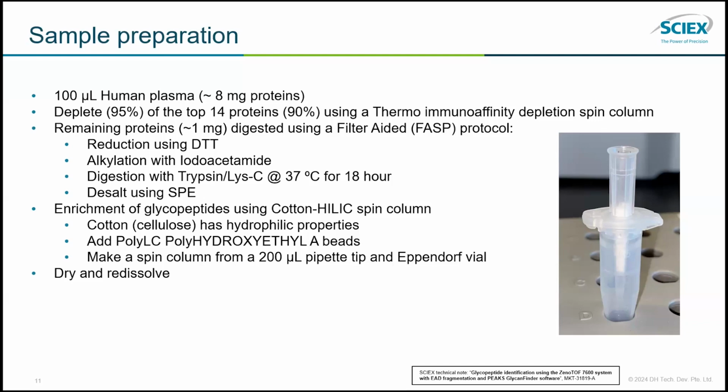It acts kind of like a HILIC phase, a very cheap HILIC phase, of course, and it also holds the HILIC beads together in the pipette tip, right? So that provided, as you will see later, a very efficient way of enriching your sample for specifically glycopeptides.